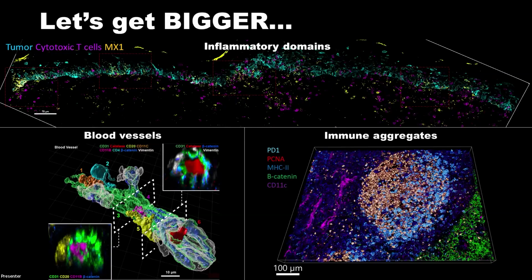Image data files are orders of magnitude larger, and analysis is slower. But what I have hoped to show you is that 3D can offer deeper as well as complementary insight to existing profiling methods. We showed that high-resolution confocal is needed when the subject matter is larger than the tissue thickness itself. In our case, this was 35 microns. However, there are a lot of biological phenomena that exist beyond 35 microns.